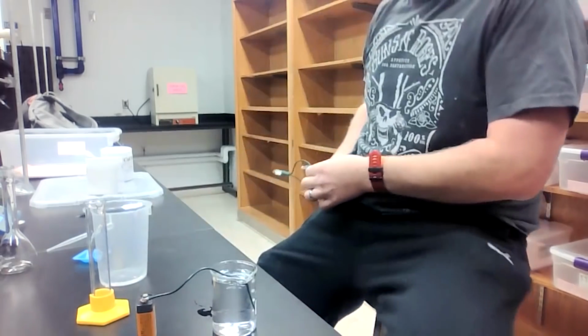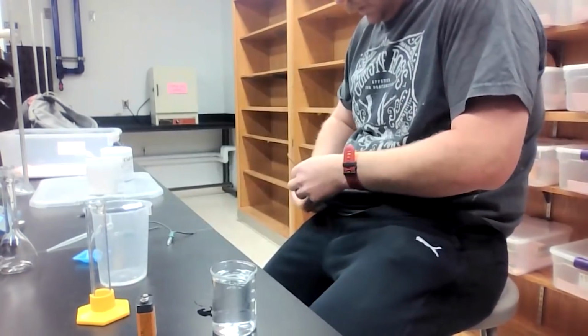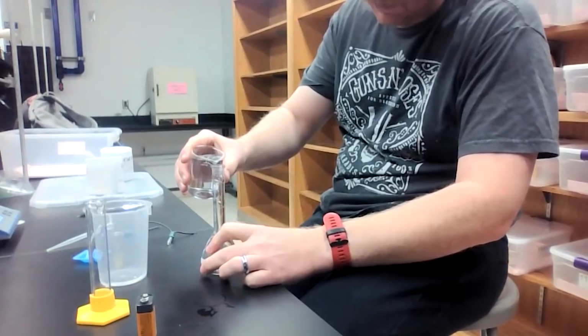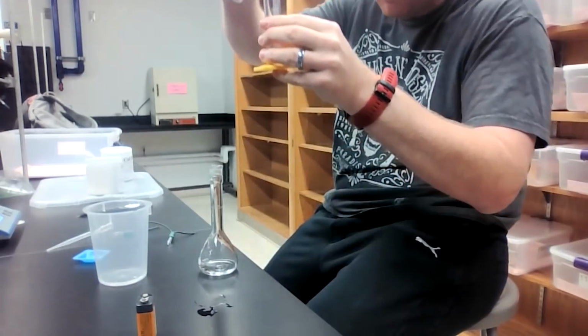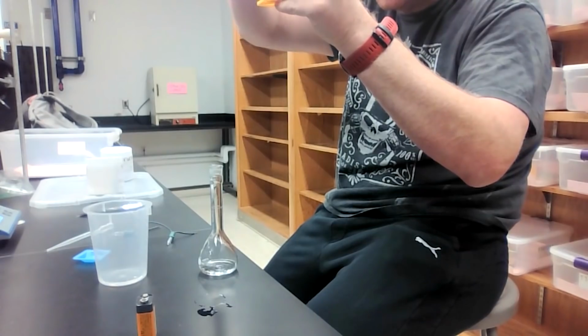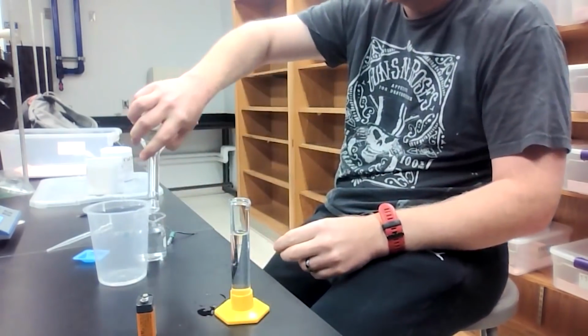Now the last trial that I want to do is I want to do one last dilution. So I'm going to take 25 milliliters. Oh, what am I doing? I'm going to empty this out. But I'm going to take 25 milliliters of the solution that I just tested. Now, again, going to my waste container.